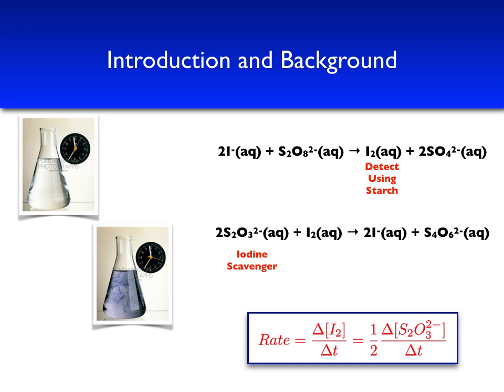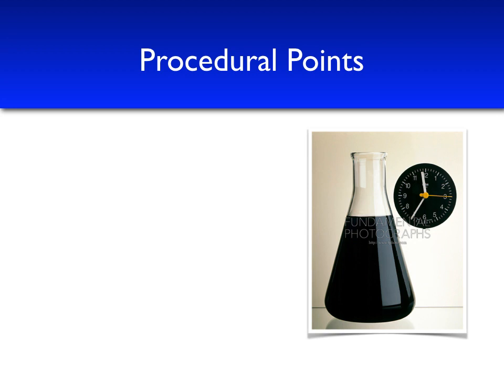This equation, that the rate is equal to 1/2 the concentration of thiosulfate over the time, is equation 8 in your procedure. It is really important that you use equation 8 to do all calculations. Here are some points about the procedure for this reaction as you watch the videos.